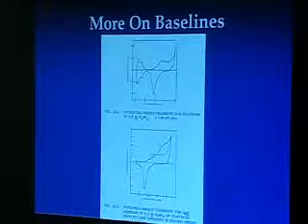If after a couple hours it still hasn't developed and you're getting a little frustrated, then you have two other options. Nitric acid often will clean off the electrode, and then you'll have to scan it again because you put some oxide on the surface when you do that. You've got to get back to this pattern. And if that one fails, you can stick it in a flame, assuming that whatever is chemisorptive is organic, that will take care of it. But now you have a lot of oxide. You have to scan for a long time to get back to this pattern. In fact, often after a flame, you want to abrade the electrode surface because there's so much oxide to remove. You just want to mechanically remove it, and then you have to cycle.